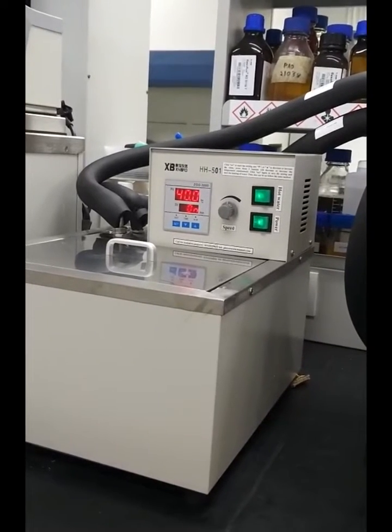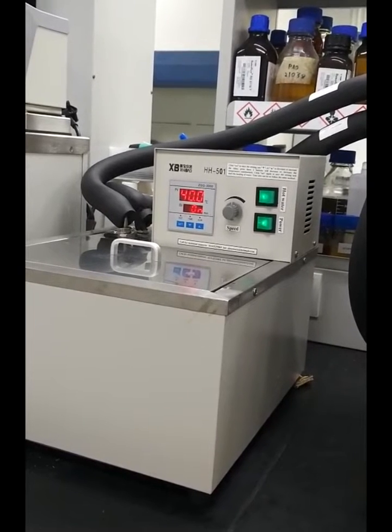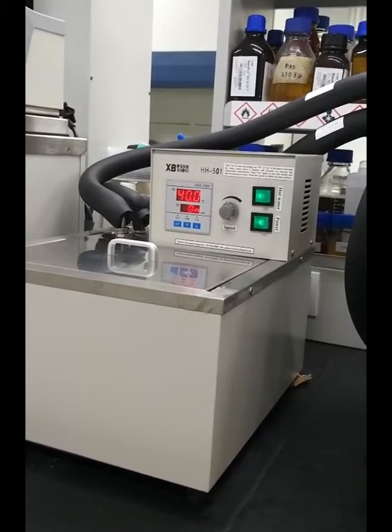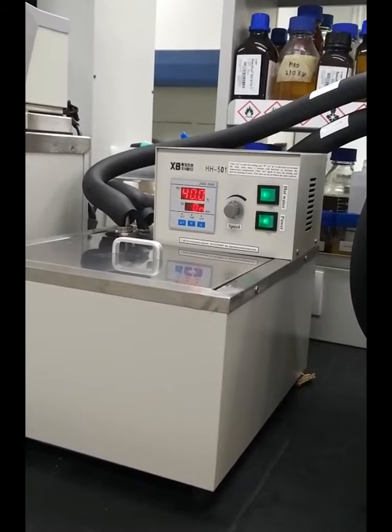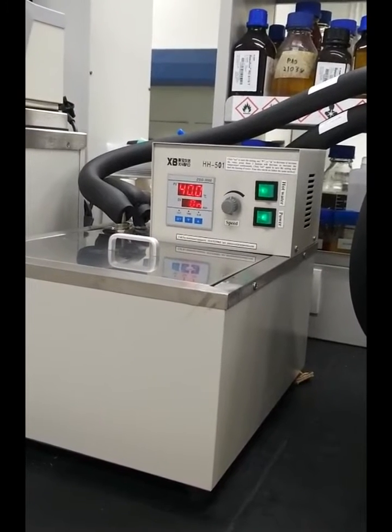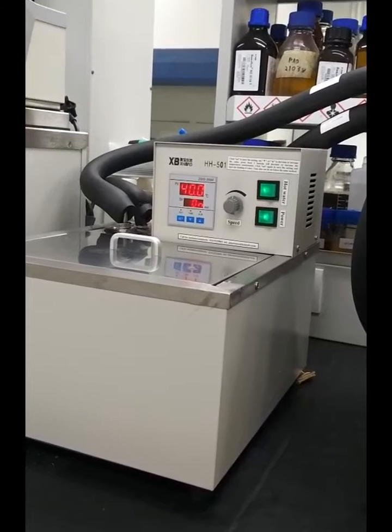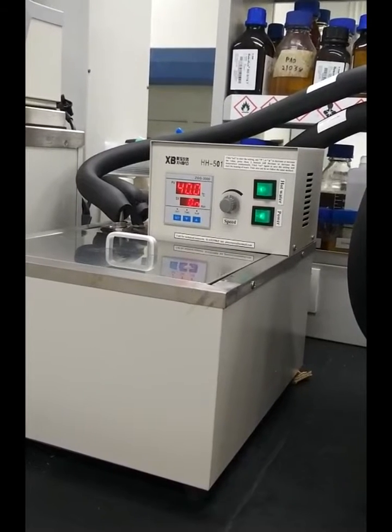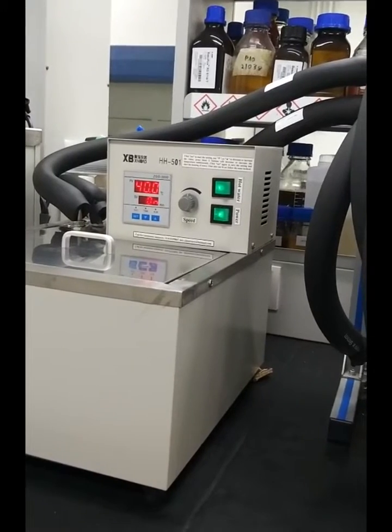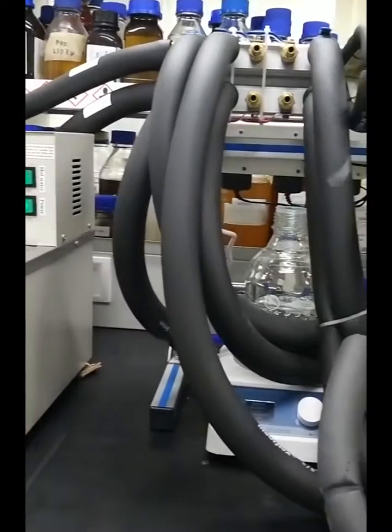Here we introduce our system for wax deposit. The system was designed for the testing of wax deposit with the mechanism of cold finger. The system includes a cycling heating water bath, which will provide high temperature to the reactor.